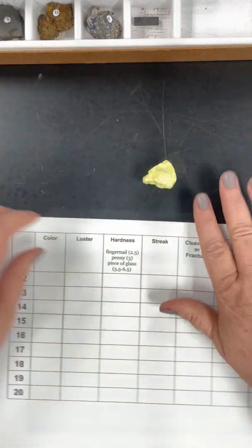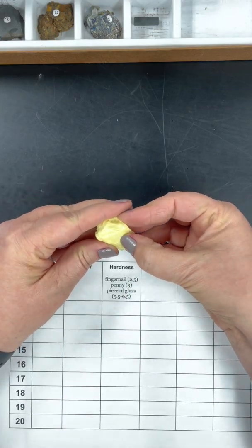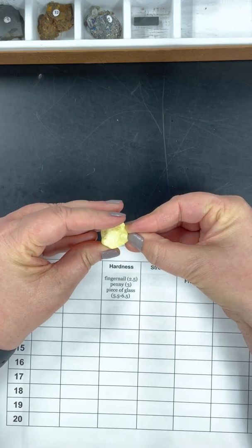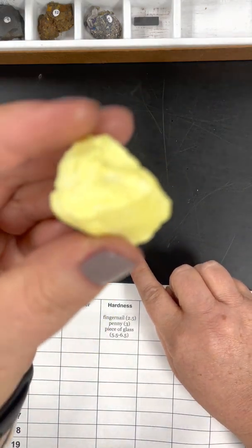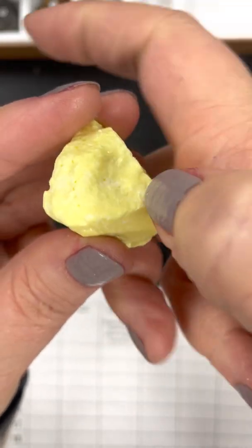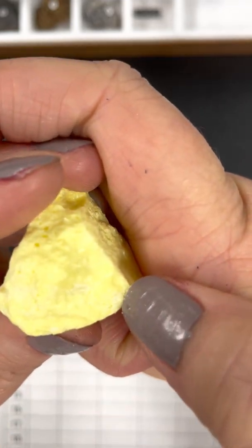So I'm going to take my fingernail and try to scratch this. Okay. Oh, here, this is a good one. And I absolutely can scratch it. Can you guys see how brittle that is? Let me see if I can get it to focus. There we go. I can just take my fingernail and scratch it, and you can hopefully see right here where I'm scratching it with my nail. All right, so this is definitely a 2.5 or less.